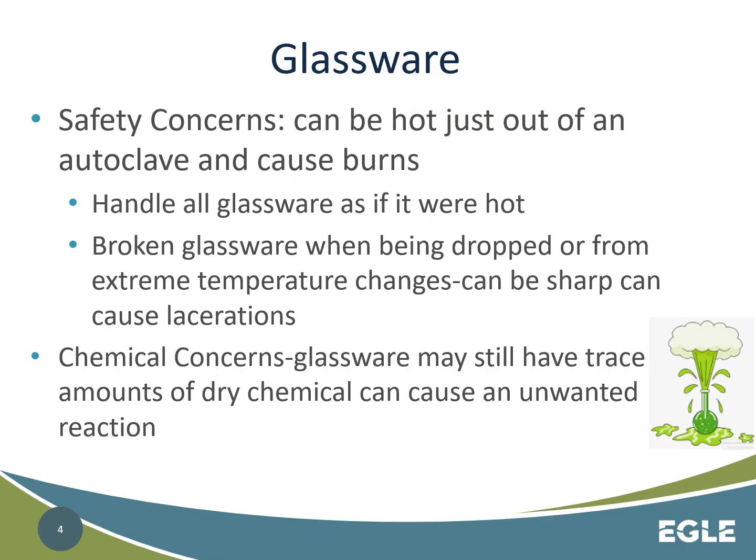Well, 121 degrees Celsius is much over the boiling point of water, over 200 degrees Fahrenheit. So they could be extremely hot, and there's nothing indicating it. So all glassware should be treated as if it's hot. Another thing, with taking hot glassware and immediately exposing it to cold, it will shatter.